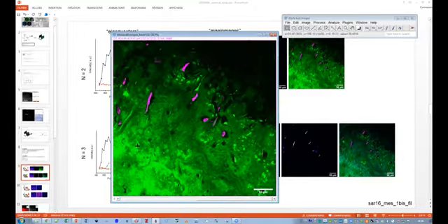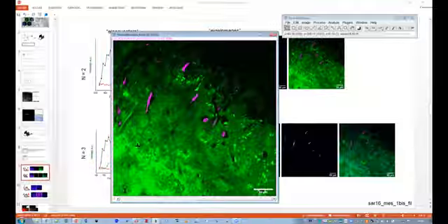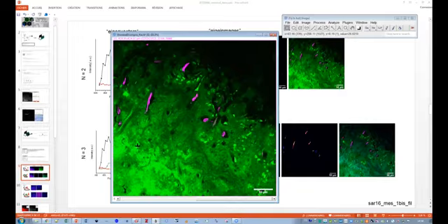And Juliette, the eigen images, they are characterized by, so they come out of the PCA-like analysis, right? But they are characterized then by, they are not characterized by one spectrum, right? But they are characterized by a range of spectra which are close to each other. How does it work with the spectra of the eigen images? Because you still have some contrast, right? So the spectra are different.